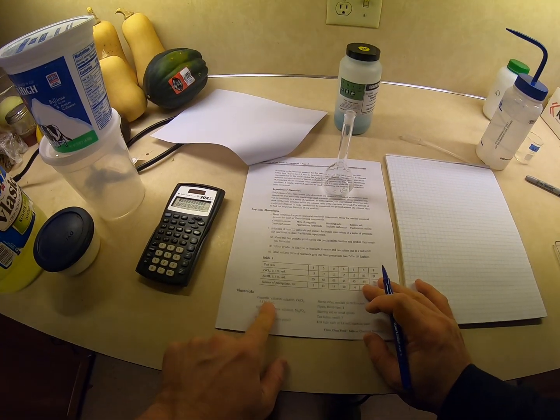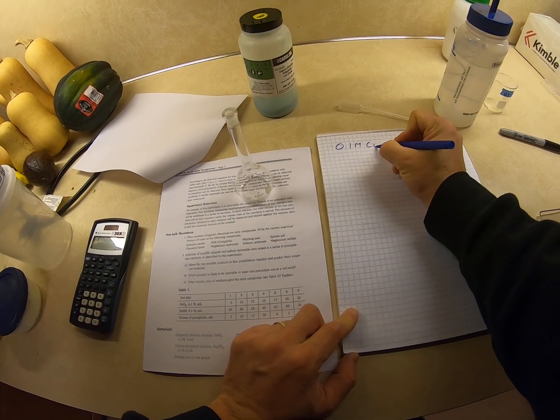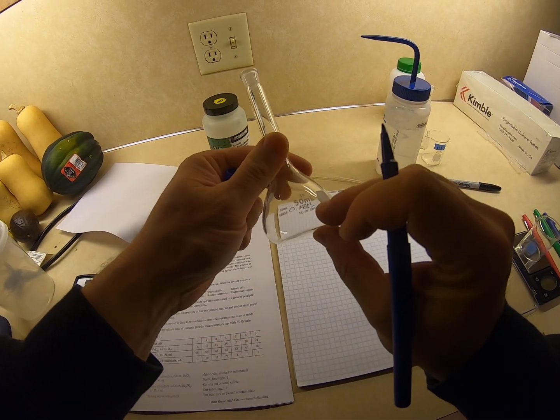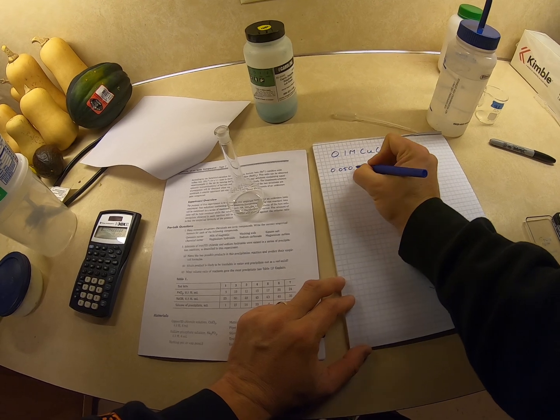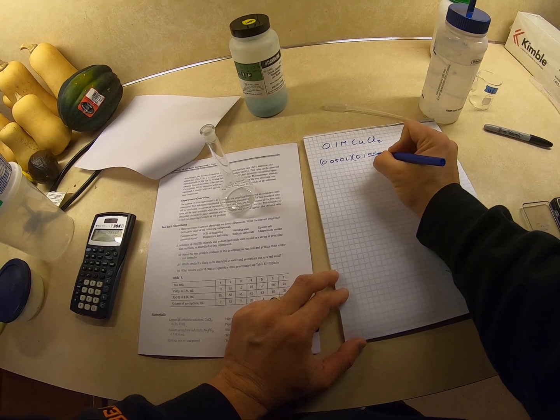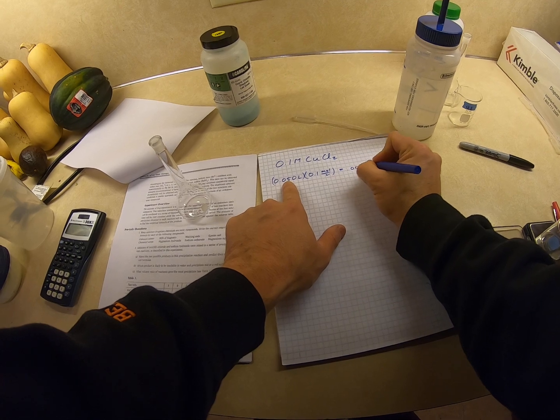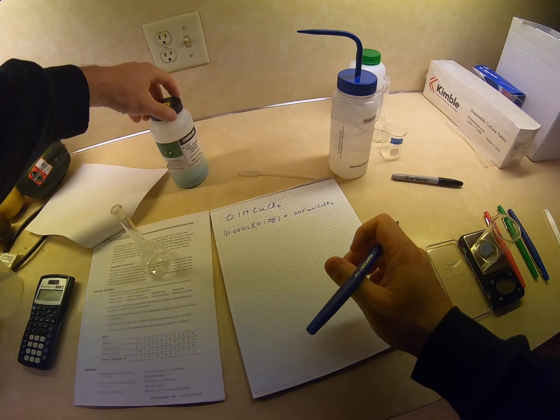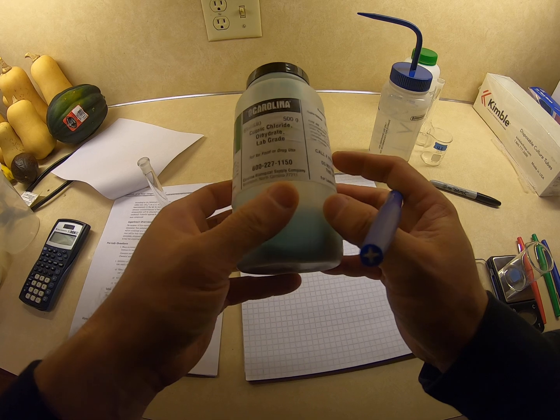All right, so I need to make some solutions. So I need 0.1 molar copper(II) chloride, so CuCl2. I have volumetric flasks that are 50 milliliters, so that's equivalent to 0.050 liters. And I'm going to multiply by the molarity, 0.1 moles per liter, and so that equals 0.005 moles of CuCl2.